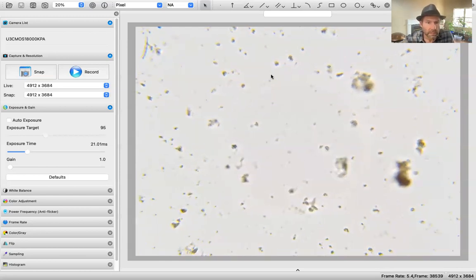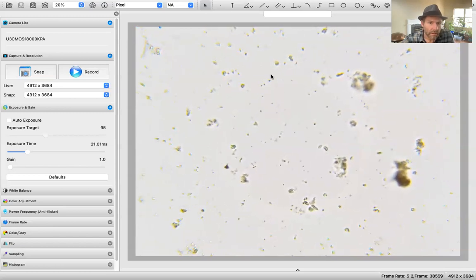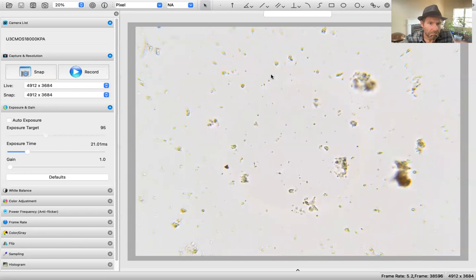I don't believe that's pointed top left. I don't believe that's actino. It's hard to tell. I can't make it out. Organic matter. All right, guys.